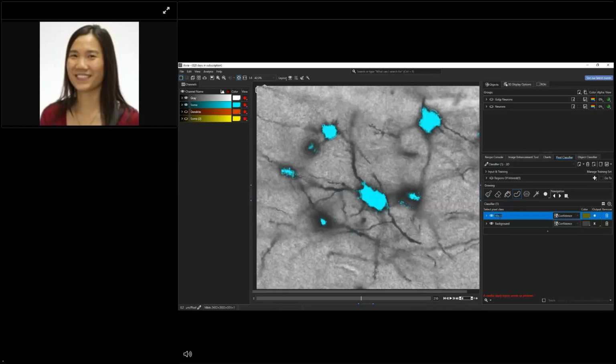So renaming this to dendrite and recolor coding that background option again. I'm also going to the feature section and clicking the line option, as I want to use the correct teaching features to optimize for line enhancement.